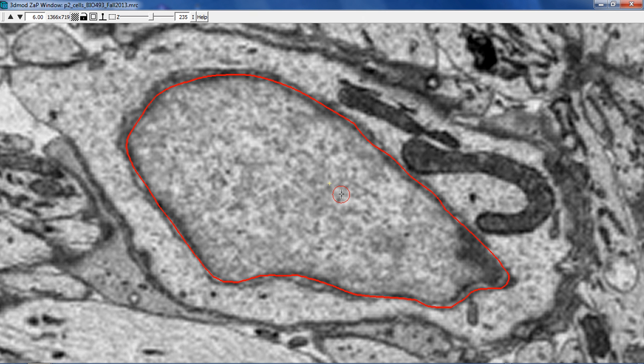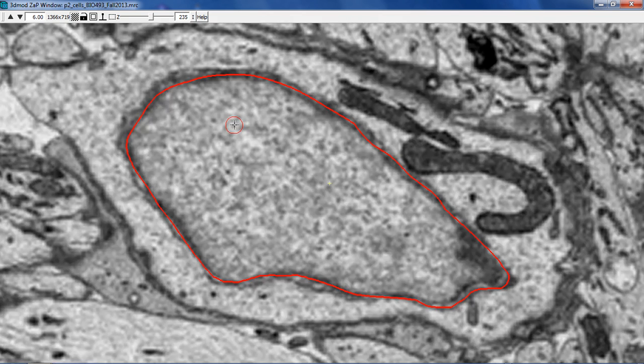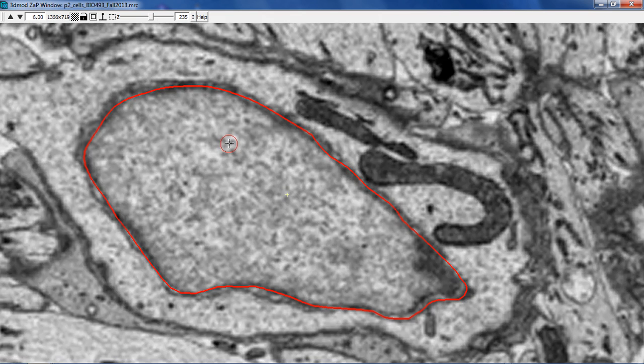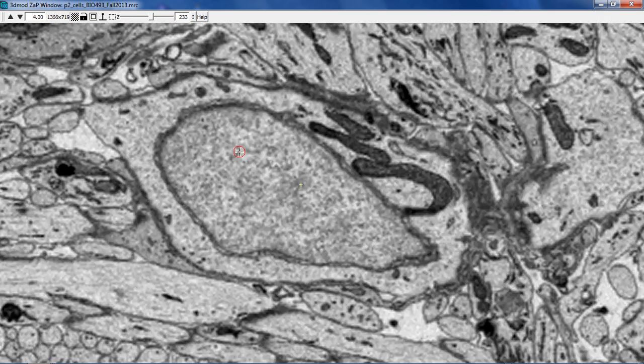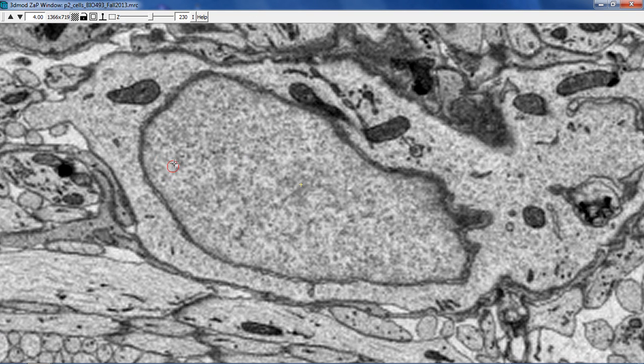There'll still be a few little touch-ups that we'll have to do, but not that many. And once the structure starts becoming a little more stable, changing a little bit less over the course of multiple slices, you should see an increase in accuracy for the linear interpolations.